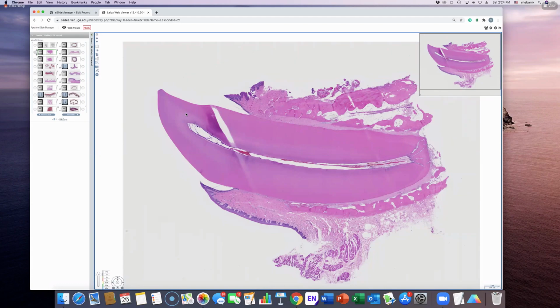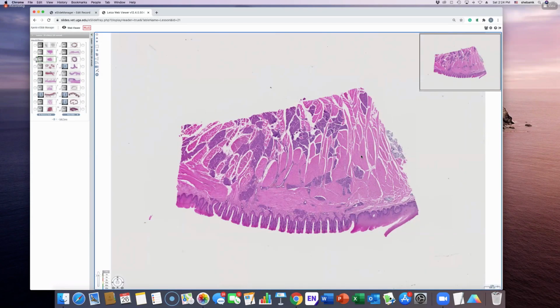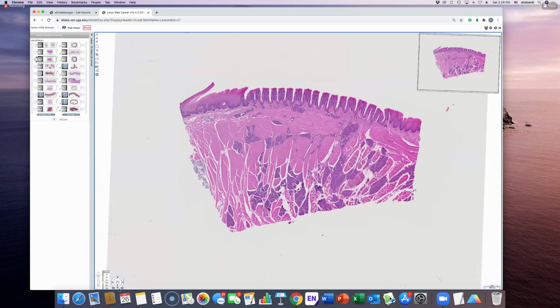Okay, so this would be a typical brachydont tooth. This is a small tooth. You're able to fit it on a slide, but if it was a hypsodont, you won't be able to fit it on the slide at all. Okay, so here is a section of the tongue. Let's flip this around like that.